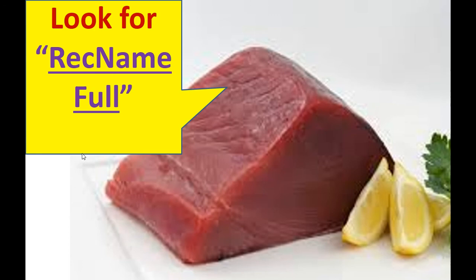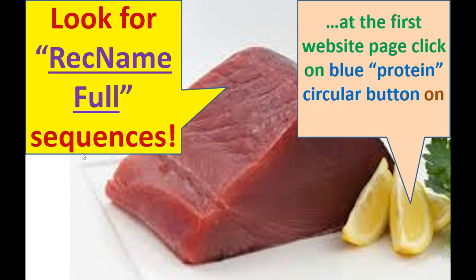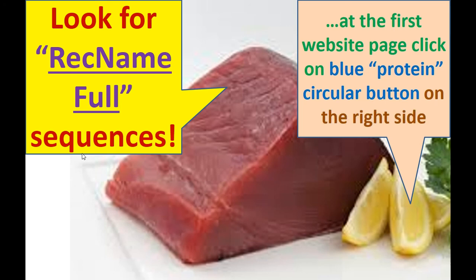Here are the 2 tips that I've learned over the years. Look for something called rec name full sequences, and at the first website page, click on the blue protein circular button, which is on the right side. Mr. Lemon's telling you that.